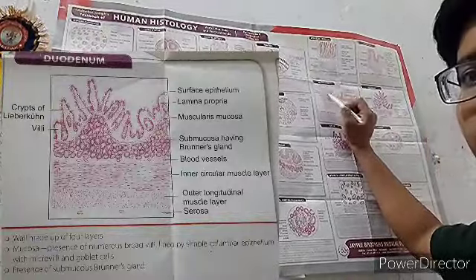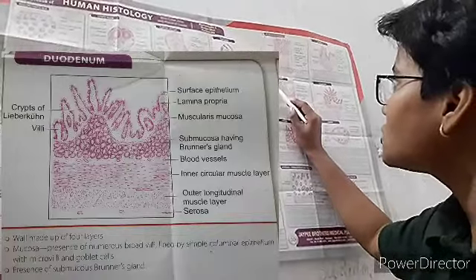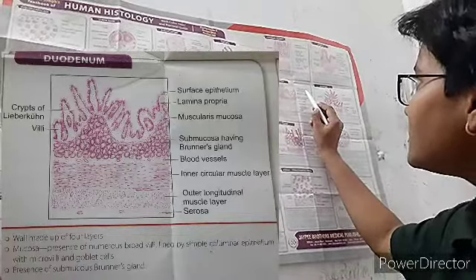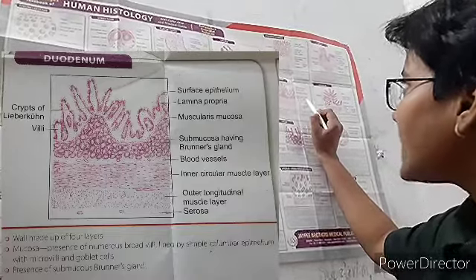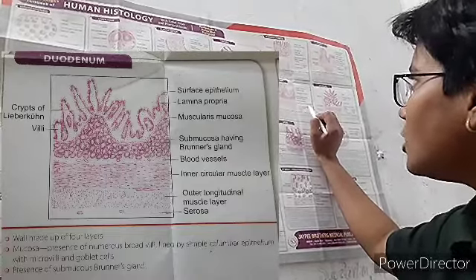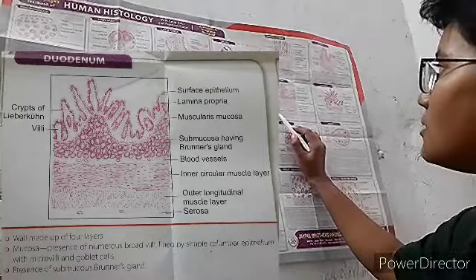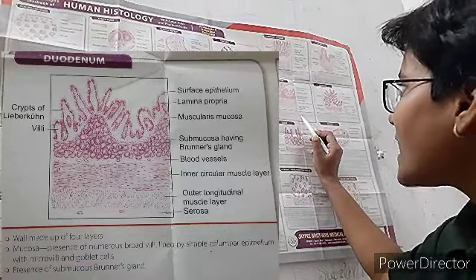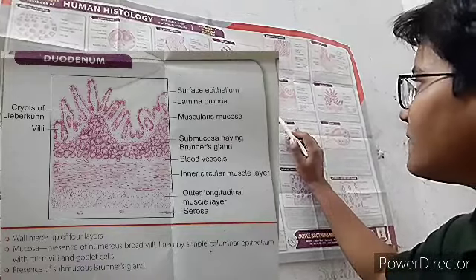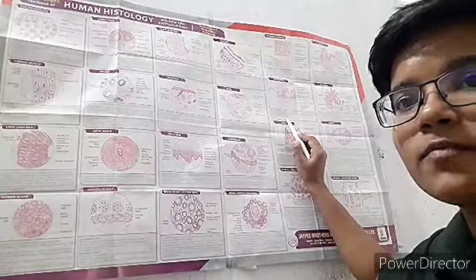Now the duodenum. Visible structures include crypts of Lieberkühn, villi, surface epithelium, lamina propria, muscularis mucosae, submucosa with Brunner's glands, blood vessels, inner circular and outer longitudinal muscle layers, and serosa. The wall is made up of four layers. The mucosa has numerous broad villi lined by simple columnar epithelium with microvilli and goblet cells. A key feature is the presence of submucosal Brunner's glands.